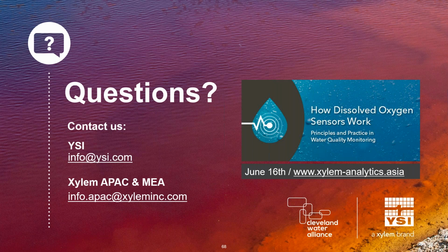Thank you. On the topic of storage, can we store the pH probe in buffer solution for short-term storage?